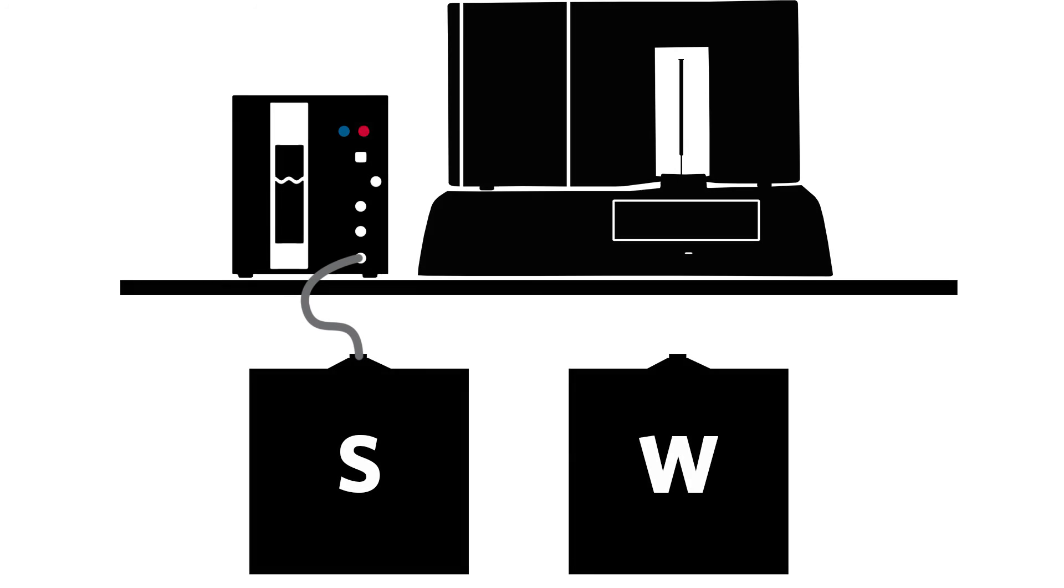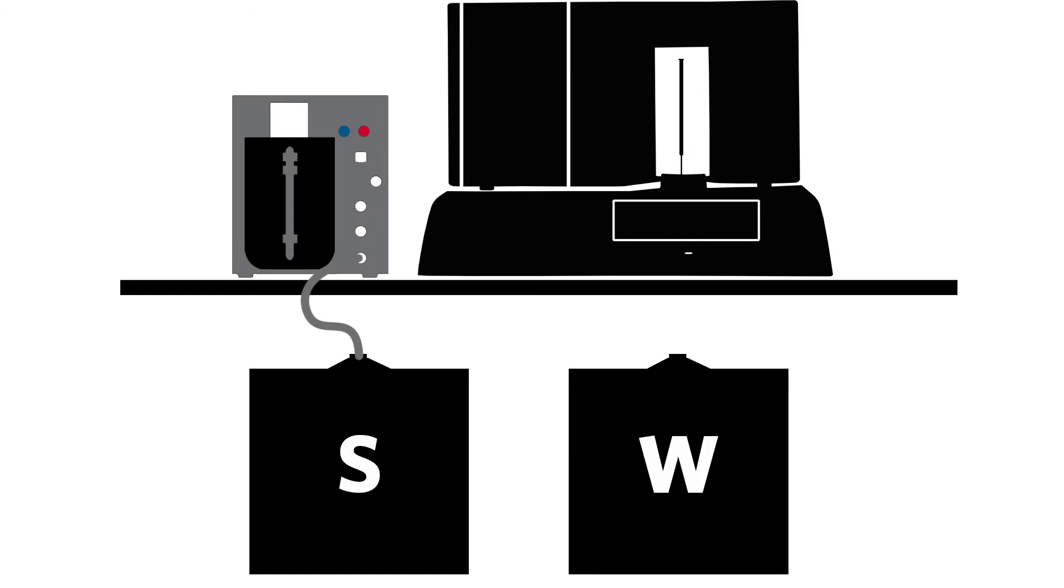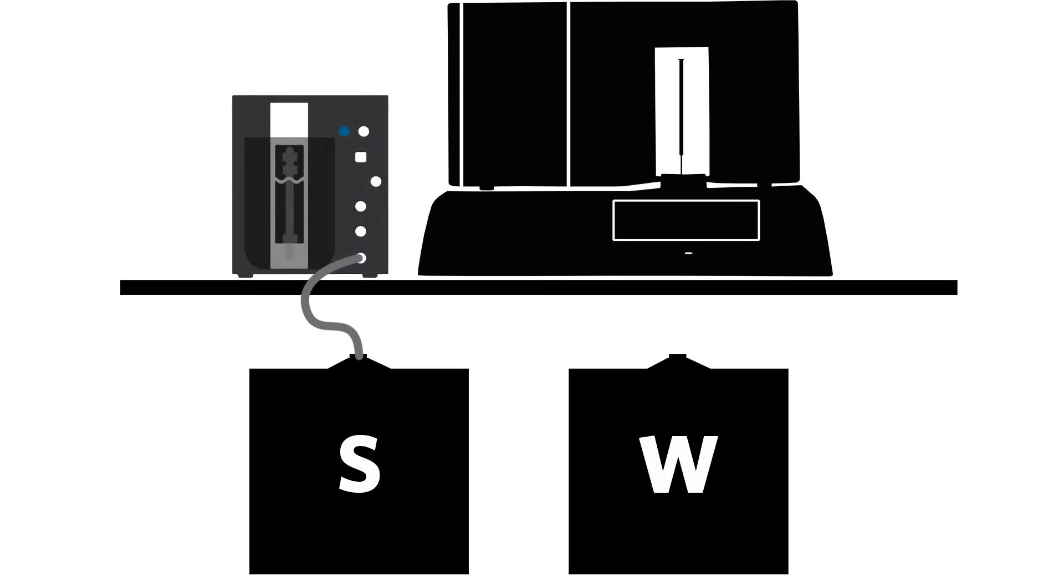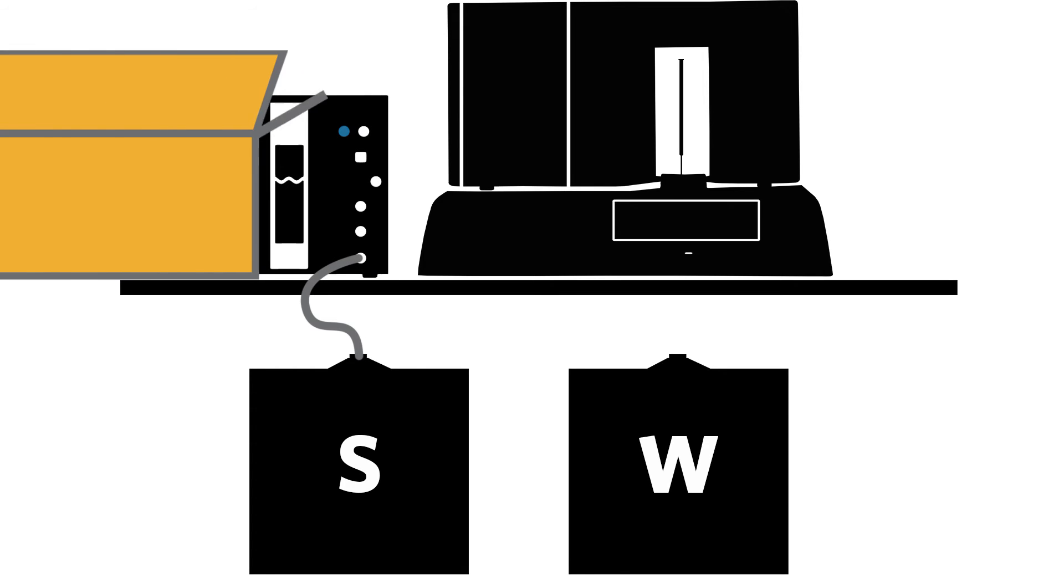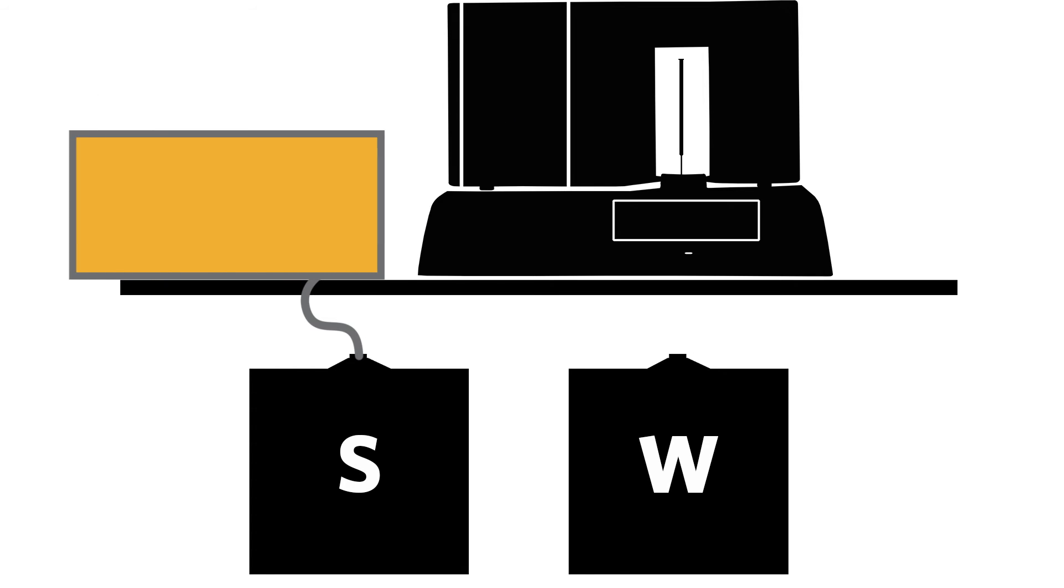When you hear a quick beep, it means the SDS is overfilled and needs to be drained. In addition, it must be drained if it is shipped or moved.